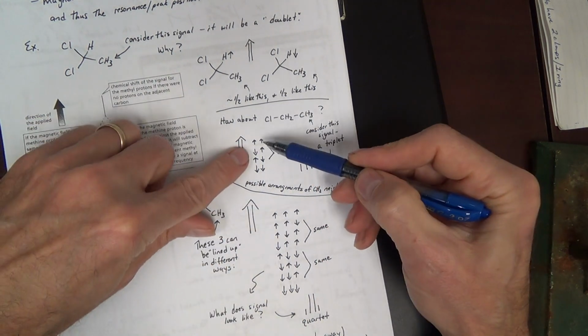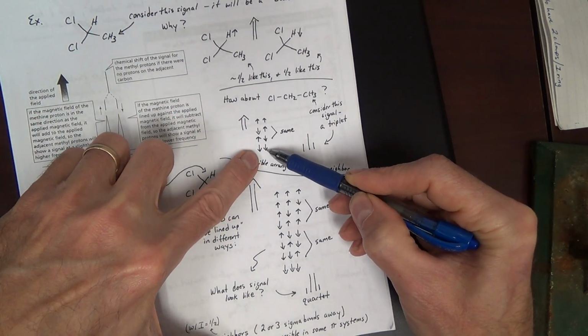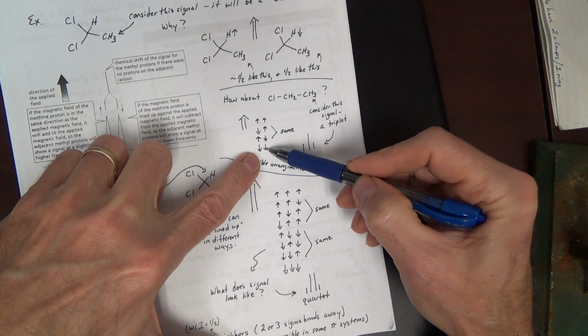The two H's can both be aligned with the external field, or they can both be opposed to the external field. That's 2 different scenarios.